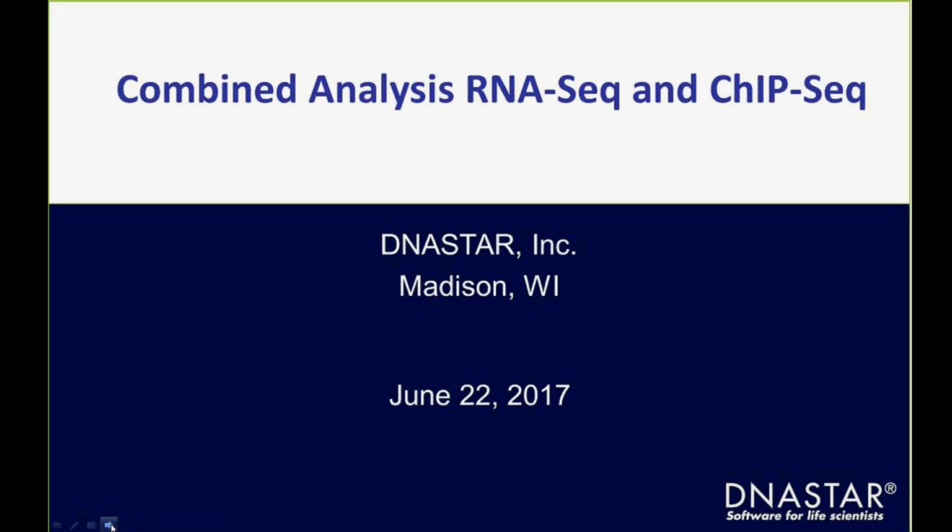And so we'll spend the latter part of the webinar going through the software, and I'll show you how to set up the projects and do some of the analysis.